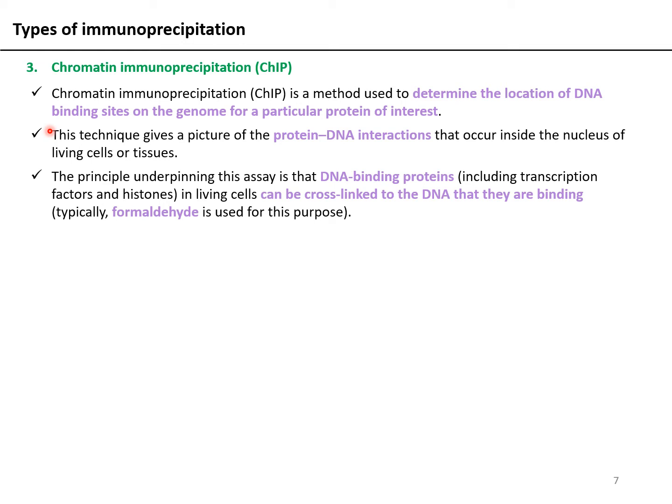Also, over here, I would like to add something that I missed out. When studying protein-protein interactions by co-immunoprecipitation, sometimes some interactions might be very transient or not so stable, not so tight. So you can stabilize that interaction by cross-linking the proteins as well. You can use several cross-linkers which simply non-specifically cross-link the proteins based on their proximity, and then you can perform the IP experiment. Several of these cross-linkers also contain reducible disulfide bridges.